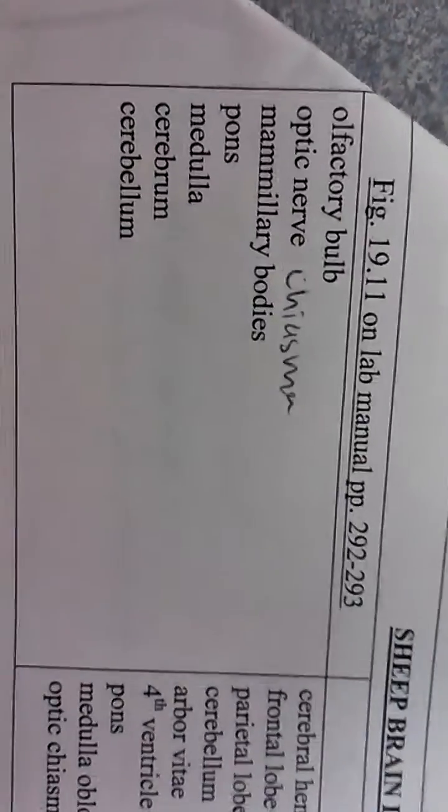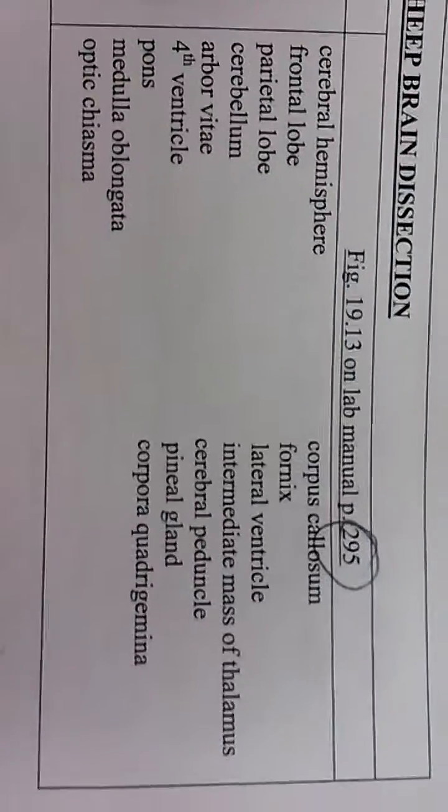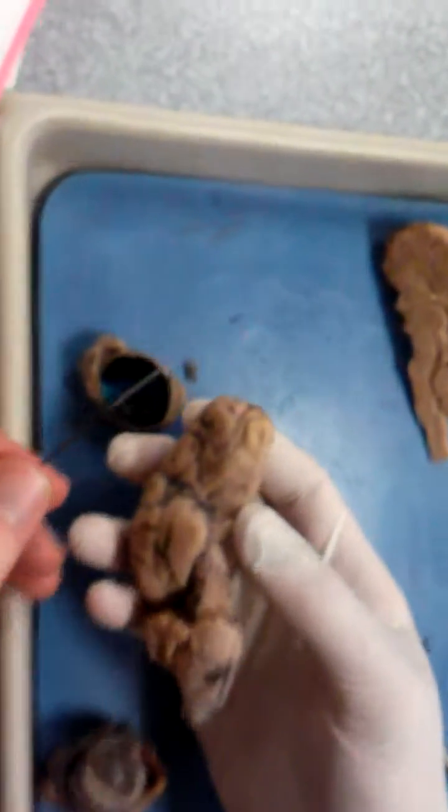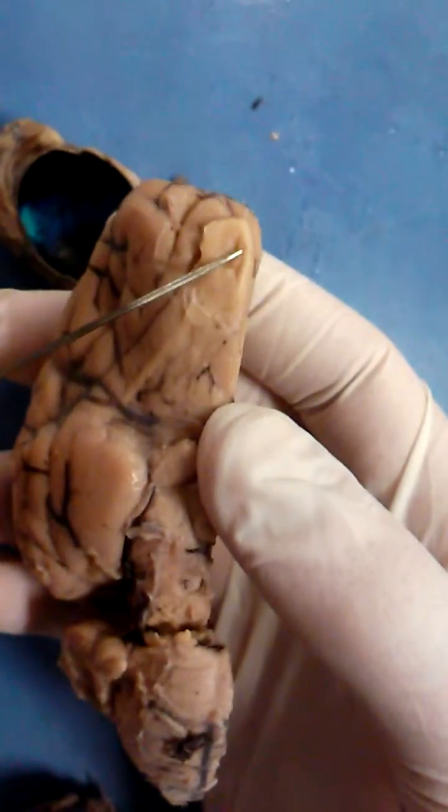We're going to be doing the sheep brain. Here we have the olfactory bulb.